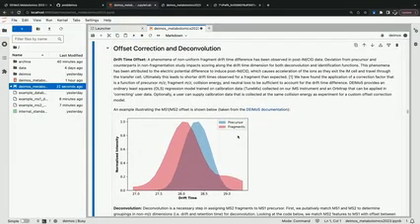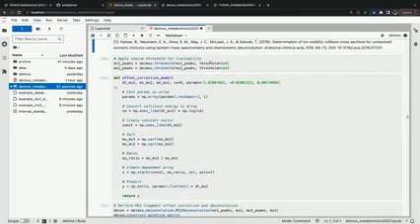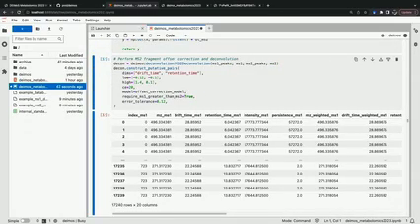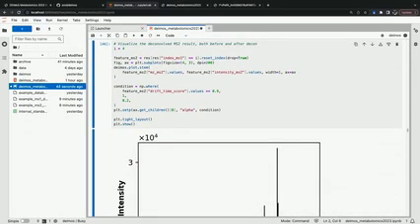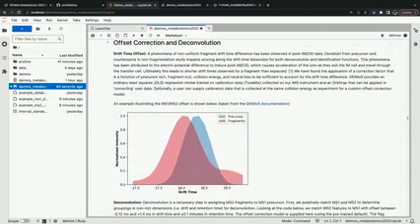Sure, yeah. And then for the next step, we'll be talking about a drift time offset phenomena and how we correct for it in our drift time values. Maybe I'll run the cells while you talk. Yeah. And so a phenomena we noticed is that there is a non-uniform drift time of fragments, different from the precursor drift time.